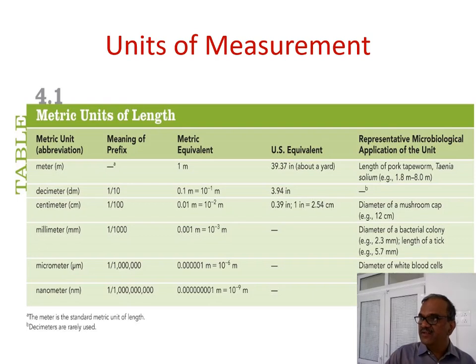At the centimeter scale, you can take a scale and measure objects viewable with our eyes. If that is not possible, then we have to keep it under a microscope and measure it, so micrometers are useful. For example, this is 15.3 microns. The length or width of a bacterium, or the length of the flagellum in a bacterium, can all be measured in micrometers.